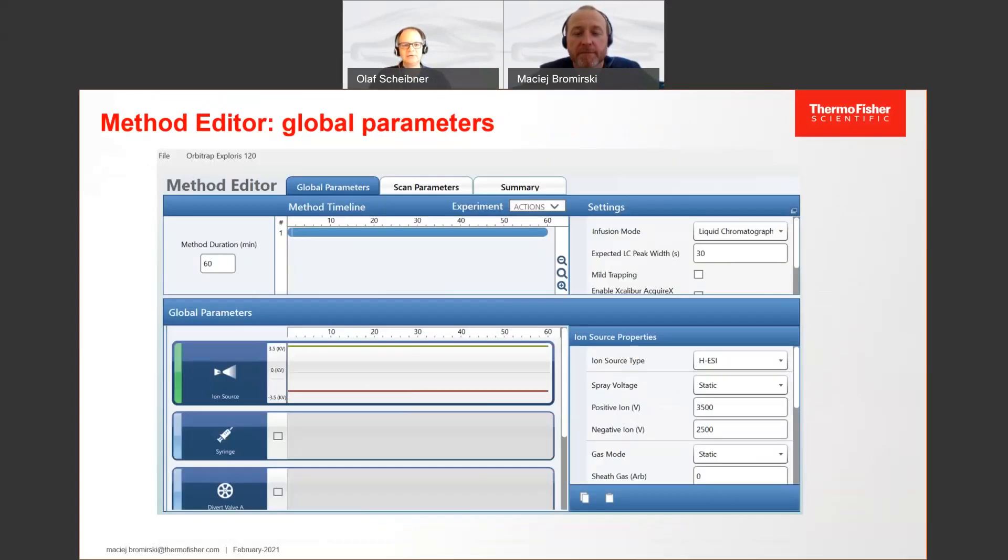In order to make things easy, on the one hand we have the global parameters. In contrast to the QExactive series, the source parameters are now part of the instrument method — it's not a separate file anymore, it's all in one file which you can exchange. You can see source parameters, you can control the syringe, you can control the divert valves. There are up to two divert valves you can control, and all the parameters you may know from predecessor instruments are present here.